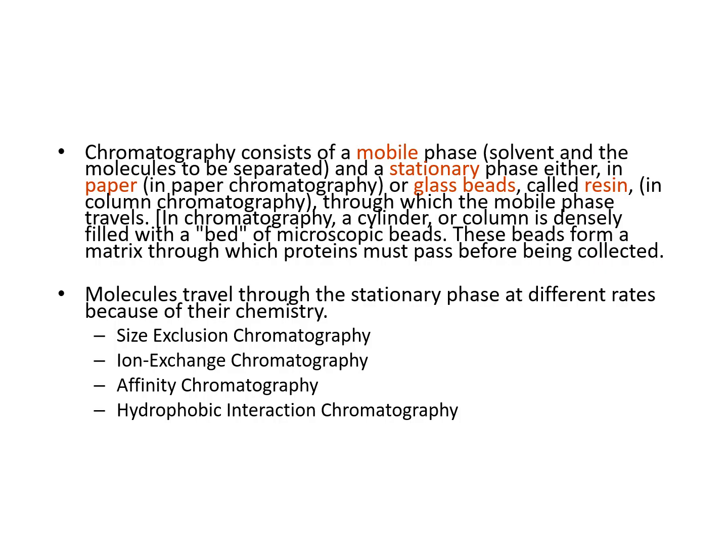Therefore, the targeted protein can be separated from the others. Normally, we have four different types of chromatography: size exclusion chromatography, ion exchange chromatography, affinity chromatography, and hydrophobic interaction chromatography. In the next few slides we will discuss each of these specific chromatographies.